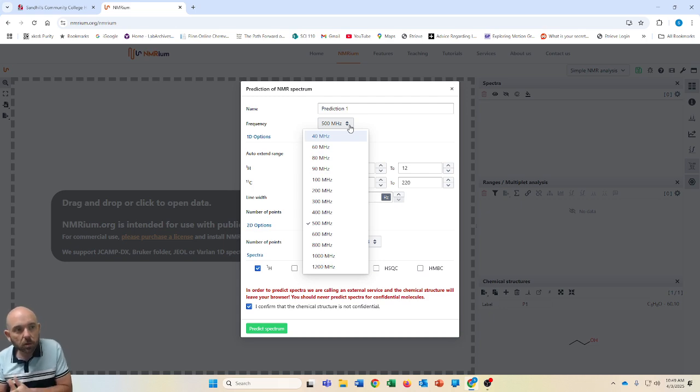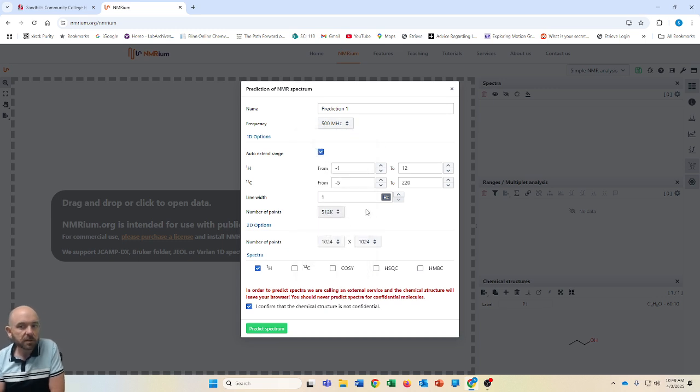To get a more realistic view, I would say definitely go over 100. Those instruments are a bit outdated now, but stay under 500 to have a middle of the road, actually-have-access kind of experience. So I believe I ran the models on these on the 500 megahertz setting, and then you can make sure you have some things checked.